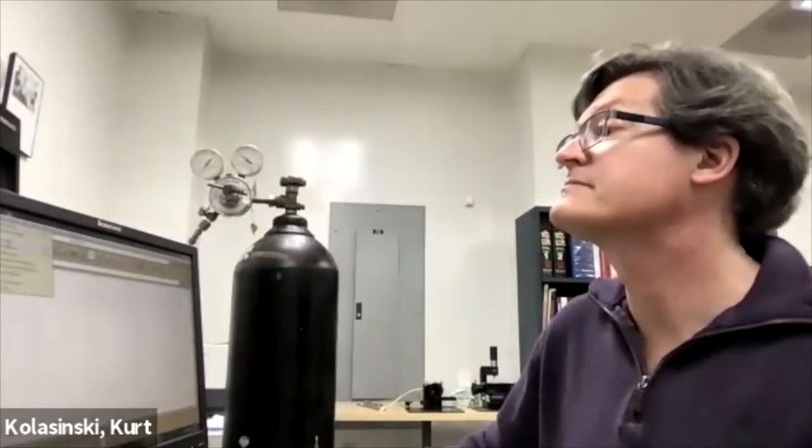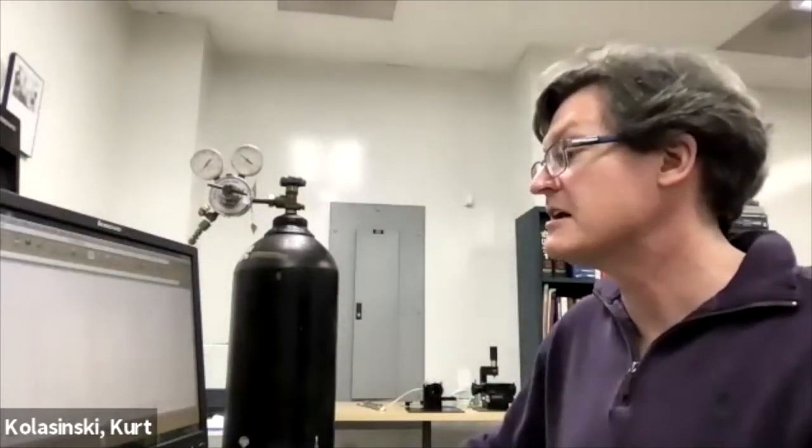Looks like a bunch of doublets. But if you change the resolution, you're not going to be able to resolve close-lying peaks to each other. If you take more scans, right now there's not a lot of signal to noise back here, and actually our detector is pretty good. There's not a lot of noise in it, but you can get to see some really small peaks if you take more scans. So I'm going to go to 128 on the one I'm going to give you, and then we'll be able to see a lot more.